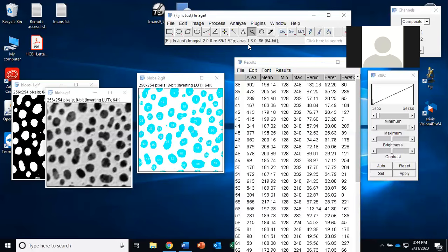You've got a bunch of blobs in both channels, and what you do is you pinpoint the centroid of all of those different blobs, and then you set some sort of threshold and say, okay, if I have a centroid in my magenta channel and a centroid in my green channel, and those are within 3-4 pixels of each other, I'm going to call it co-localized. And in my experience, that's the best and most optimal way to do it, and seems to give you the most robust and reliable data.